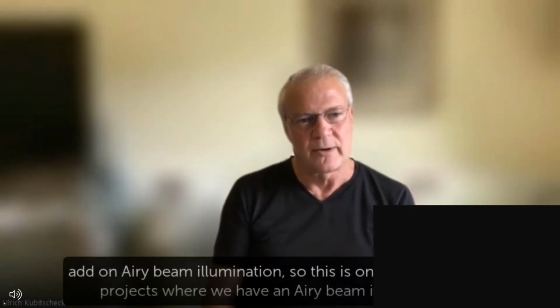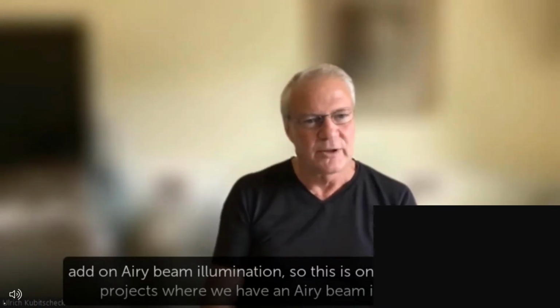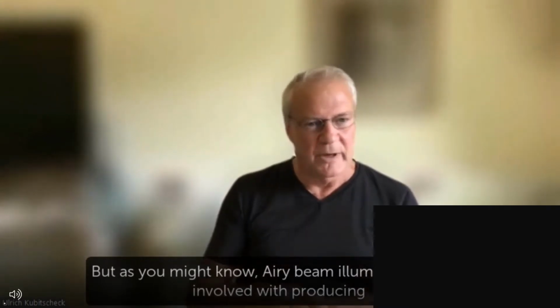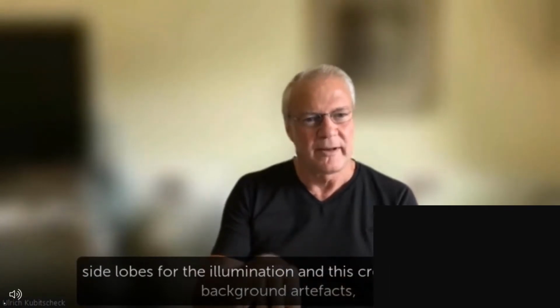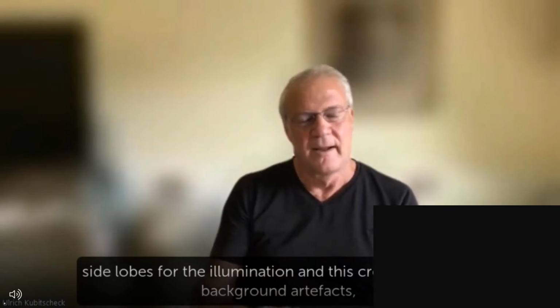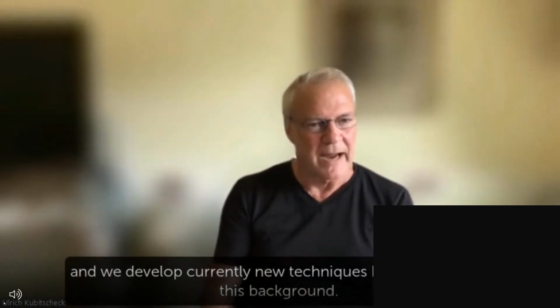This is one of the ongoing projects, but as you might know, Airy beam illumination also involves producing side lobes for the illumination, and this creates background artifacts, and we currently develop new techniques to get rid of this background.